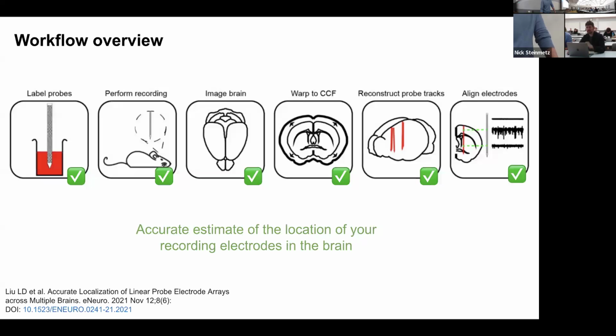The IBL has a project called the Electrophysiological Brain Atlas, which we're working on actively and is really nearing some kind of release, where we're trying to incorporate the whole IBL data set, which is recordings across the whole brain. One of the things we're doing with that is a decoder that tries to predict what brain region a particular channel is in based on its features. Sometime in the future, we'll release both a paper and that atlas in a usable form. I think the goal is to incorporate it in this GUI that Maya's working on.